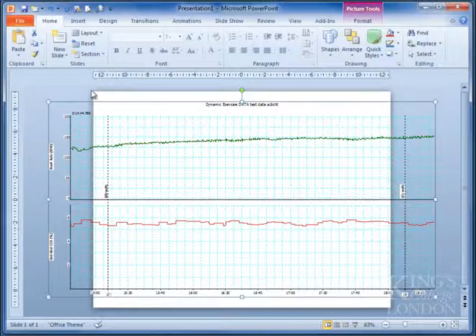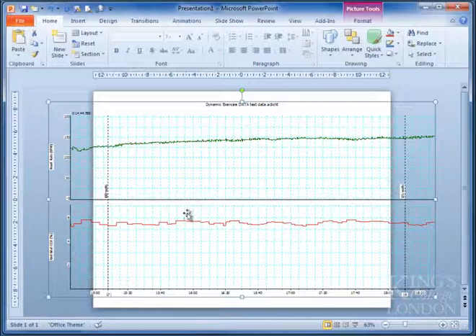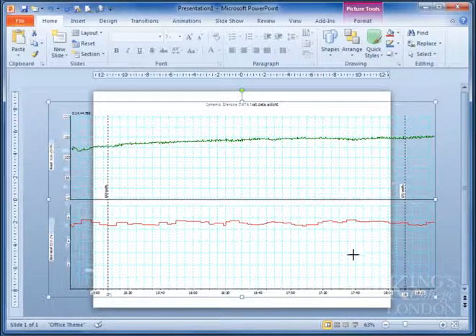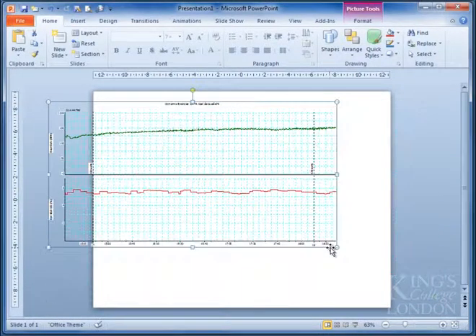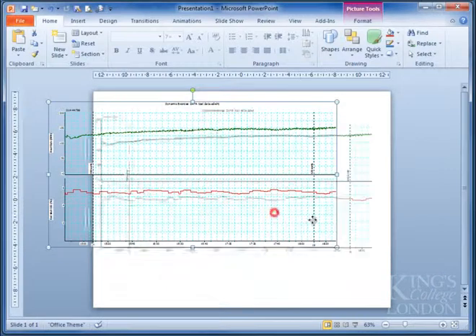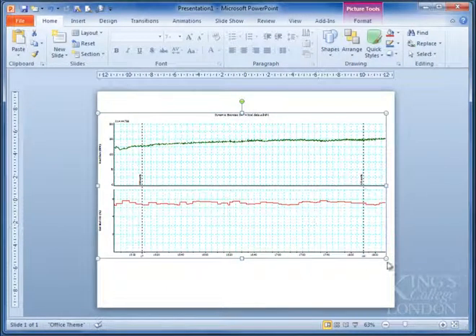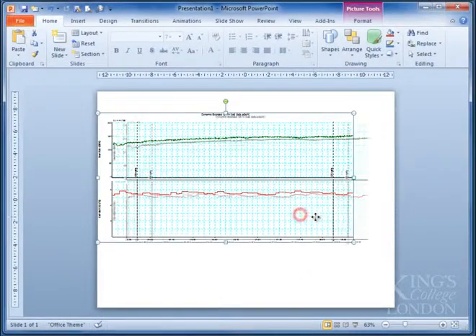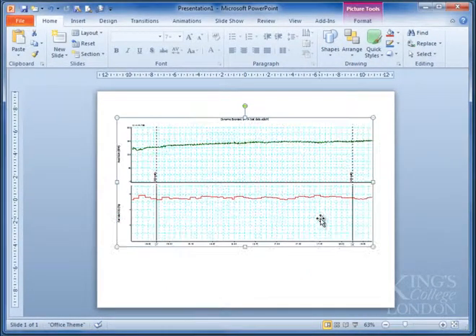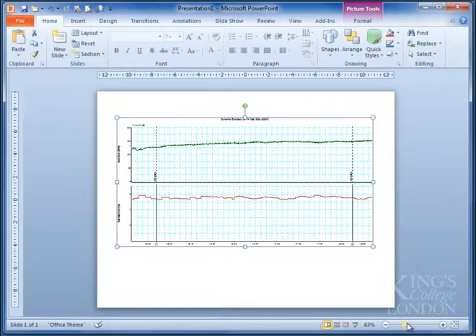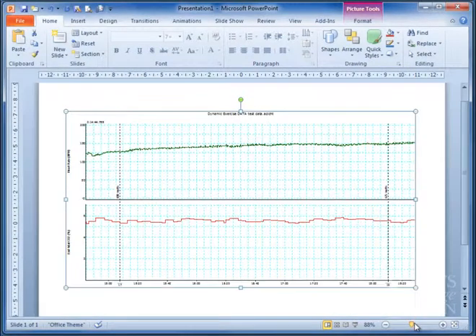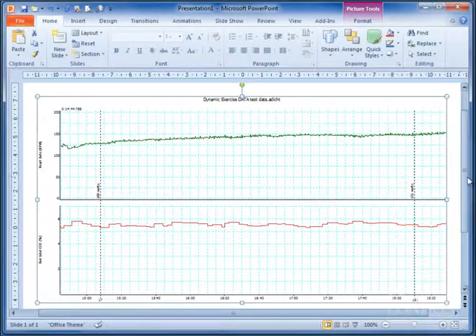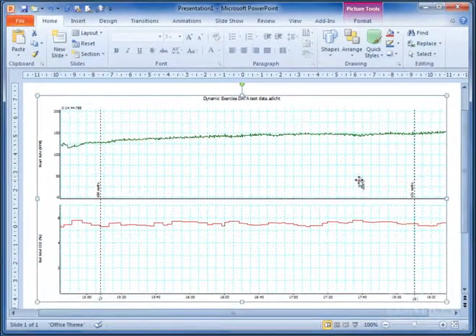Of course, it's extending beyond the realms of our page, and certainly if you put that into Word in its current size, it would be way too big. So I'm just going to make it a little bit smaller so it fits onto this page, makes it a bit more manageable. And then I'm going to zoom in so I can see the graph.